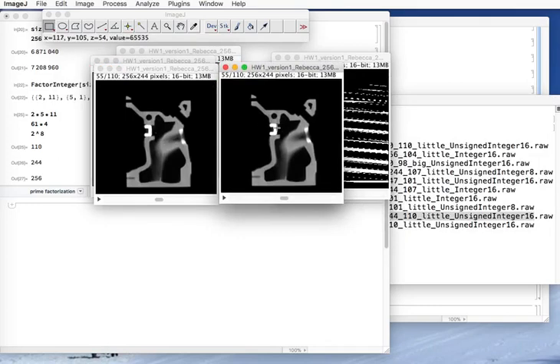This is either telling me that I have an error in my code, or we got a case where this particular data set, it doesn't matter. I have to think about this. But basically that's the analysis procedure we go through to hack one of these unknown binary files.